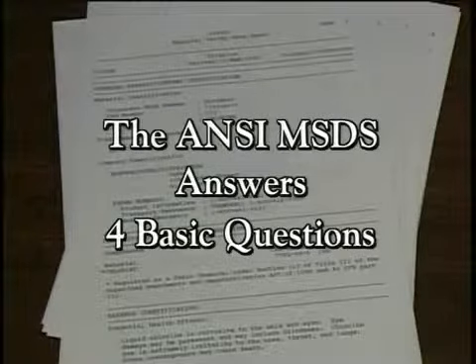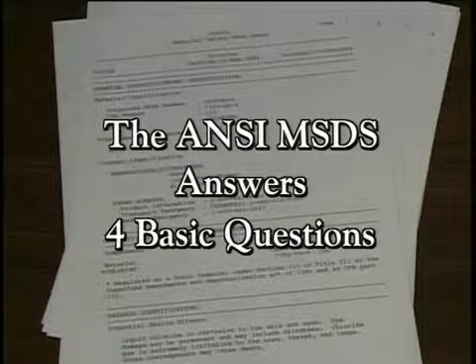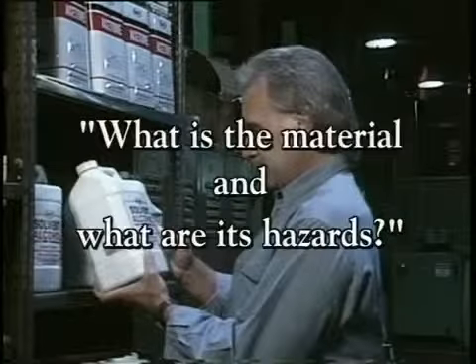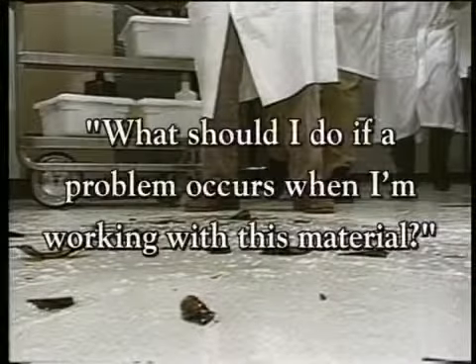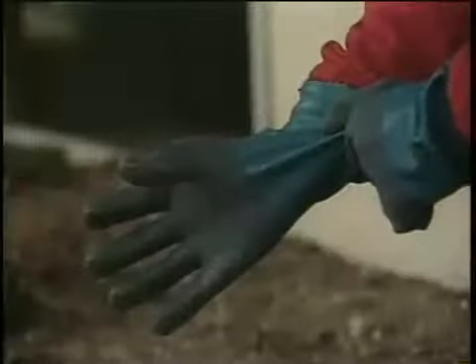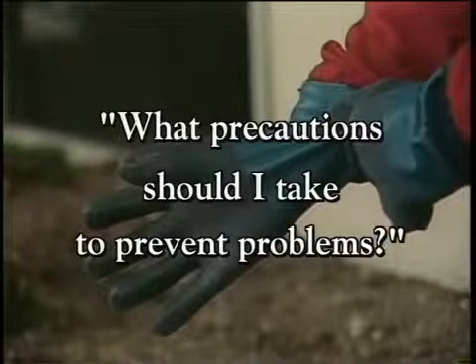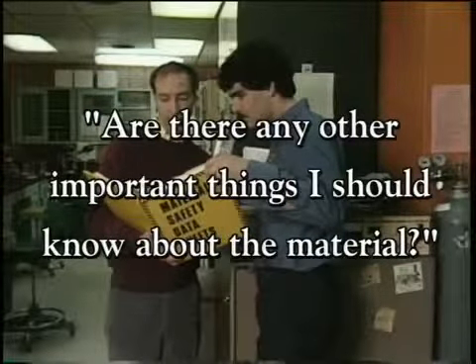The ANSI MSDS answers 4 basic questions that anyone who works around chemicals might ask. What is the material and what are its hazards? What should I do if a problem occurs when I'm working with this material? What precautions should I take to prevent problems? And finally, are there any other important things I should know about the material? Let's take a look at how the ANSI MSDS answers these questions.